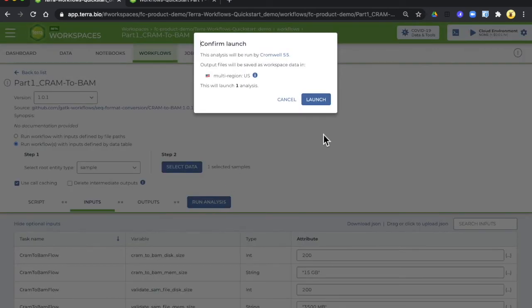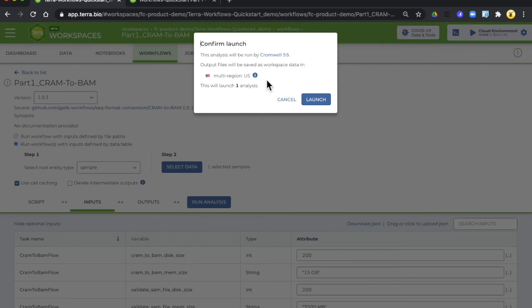You're going to be asked to confirm your launch. It tells you a little bit the engine of Cromwell and what region the execution will be run in the Google Cloud Platform and that it will launch one analysis.